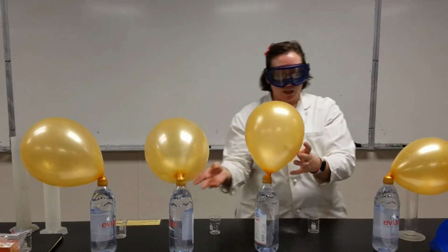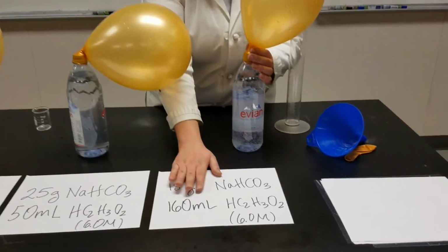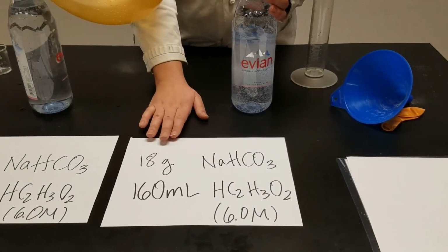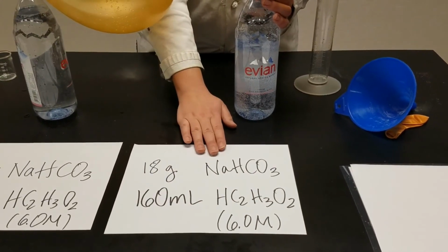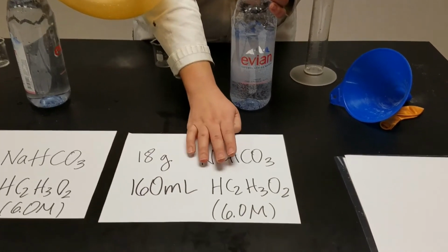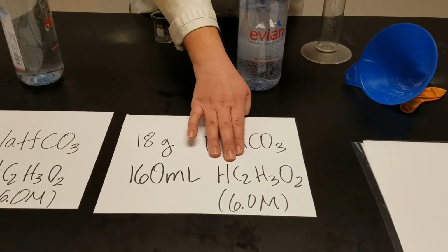We can make a conclusion that in this last case here, even though we had the most acetic acid, we had the least sodium bicarbonate. So for sure, we can conclude that our sodium bicarbonate was the limiting reactant and our acetic acid was in excess.